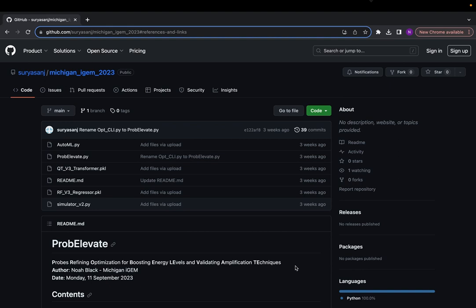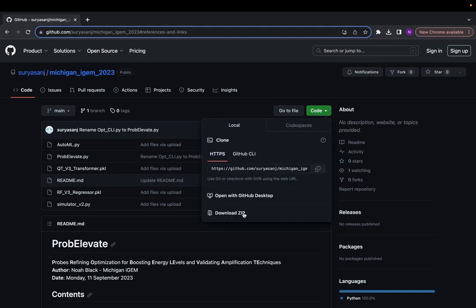All of our work can be accessed in our GitHub repository, which has an MIT license. In this repo, you can find all of the required files and objects necessary to run our CLI. It is important to note that users must have Python installed along with NumPy, Pandas, Matplotlib, sklearn, and textdistance packages. We recommend that when users download all of these files, they store them in the same directory. To download the files, click the Code button in the upper right-hand corner, and then hit the Download Zip button, which will download all of the files.